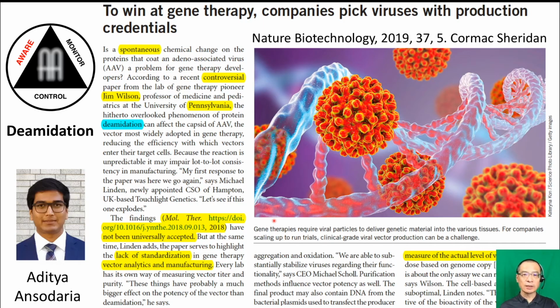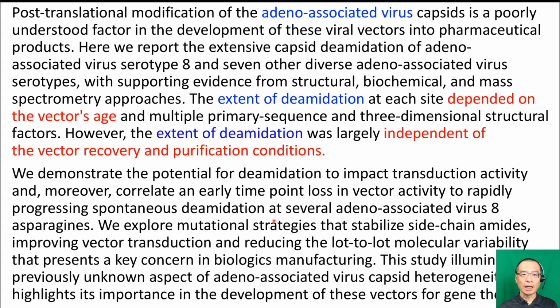And recently, there's a new modality, AAV, and there's a highlight in Nature Biotechnology about a report from Jim Wilson's group on the deamidation of AAV particles. Jim also highlighted in his paper that they did quite a thorough analysis, trying to tease out the issues, and that the findings are independent of vector recovery and conditions.